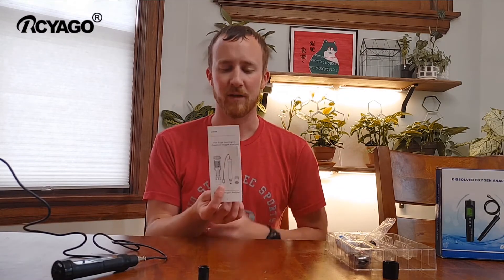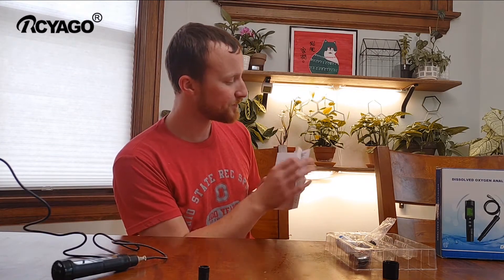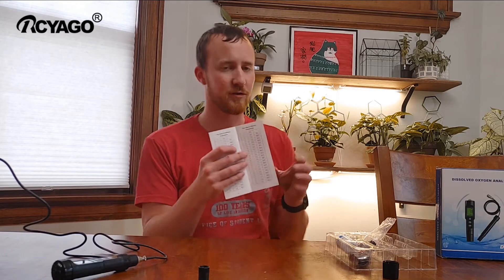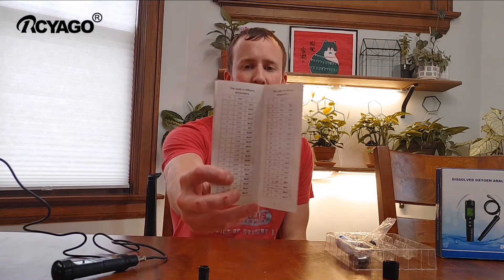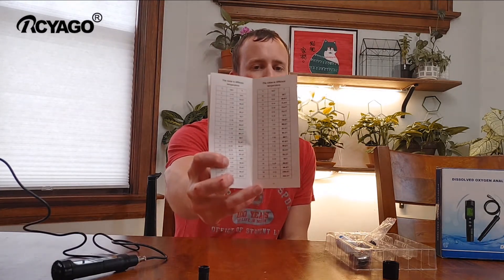It's a pin-tight meter. It comes with an instruction manual, and in the back of the instruction manual there's a temperature chart for you to adjust the dissolved oxygen to the temperature of the liquid you're measuring.